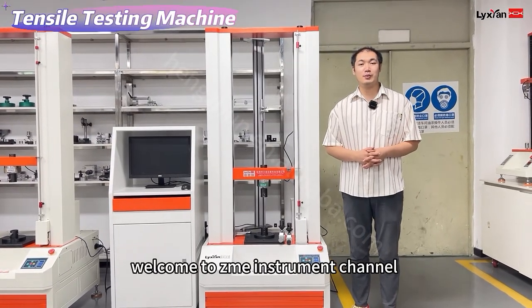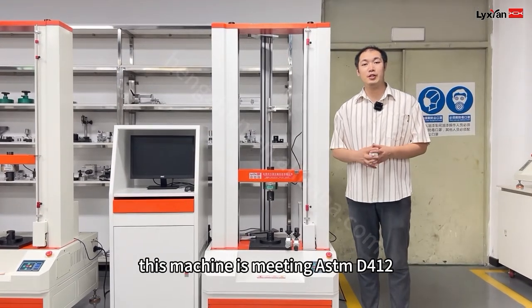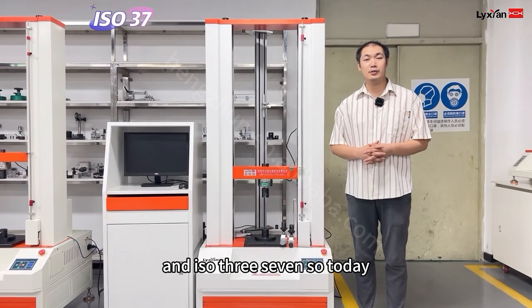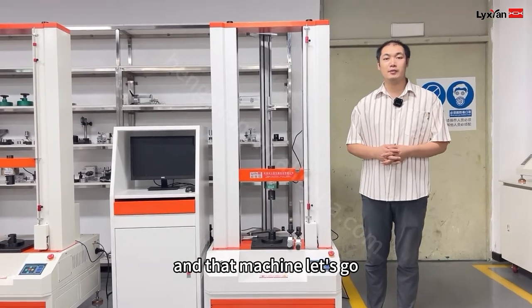Hello everyone, welcome to Nixian Instruments channel. Today we introduce the universal testing machine for rubber. This machine is built to ASTM D412 and ISO 37. Today we show you how to do the testing using this machine and cutting machine. Let's go!